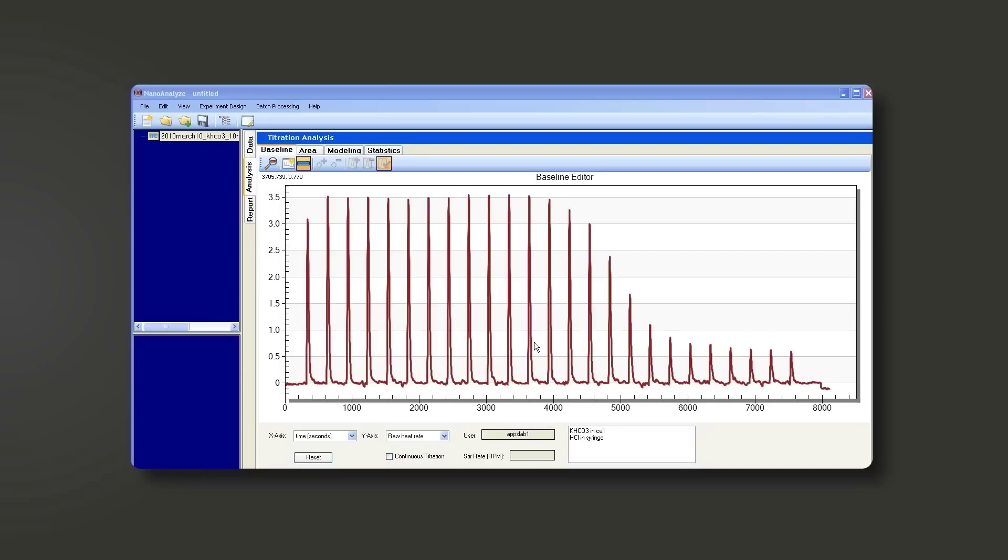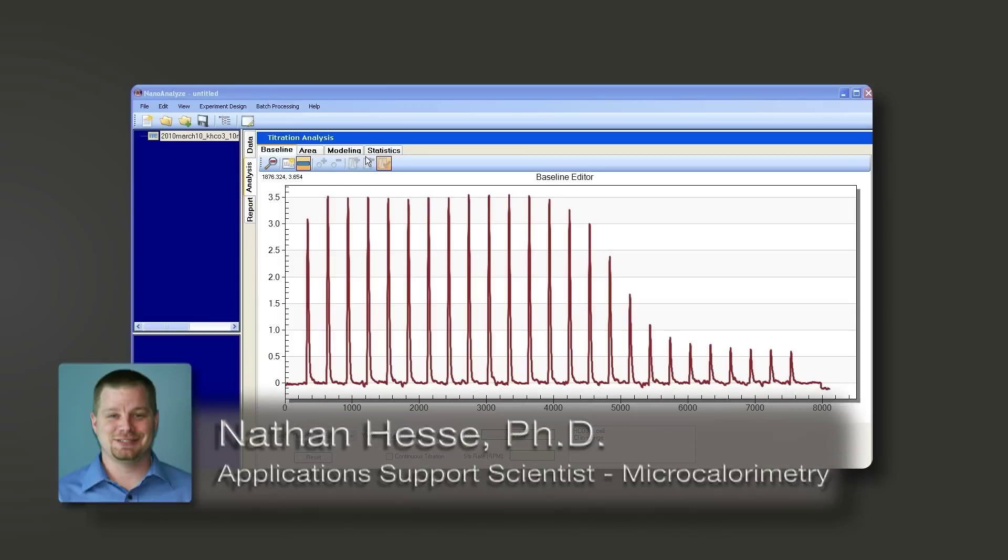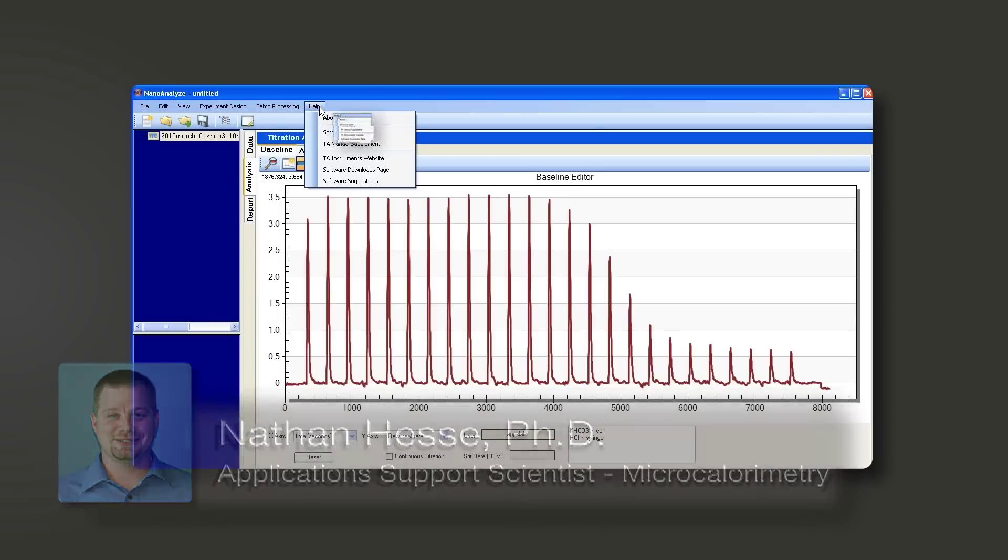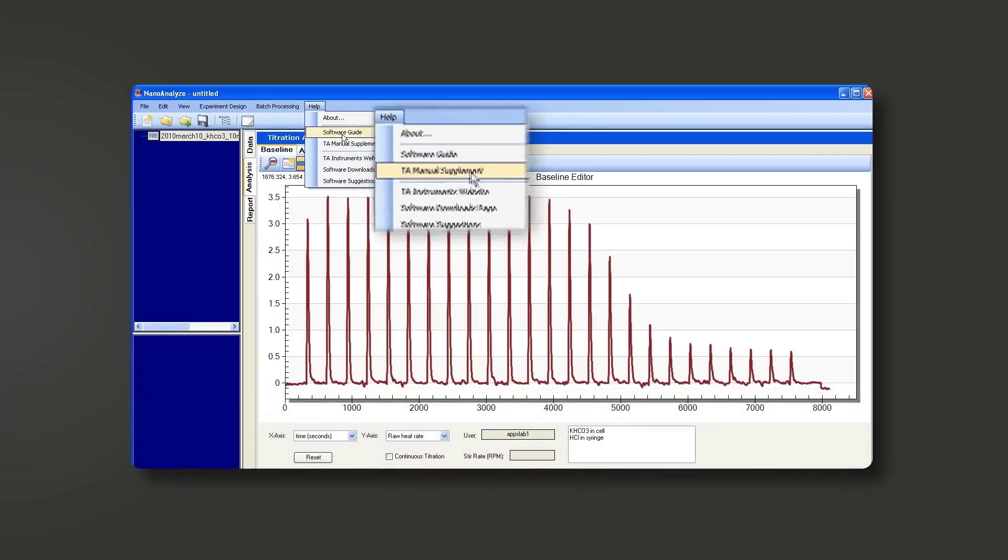In this TA Tech Tip, we'll show you how to access the help menu and the instruction manual for Nano Analyze. So go up to your help menu and click it open.